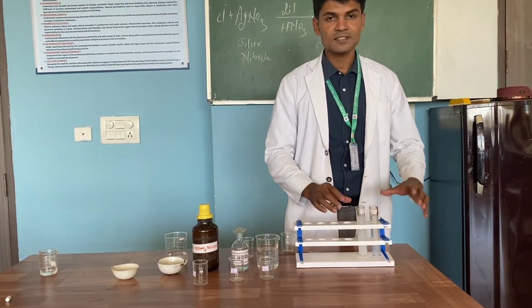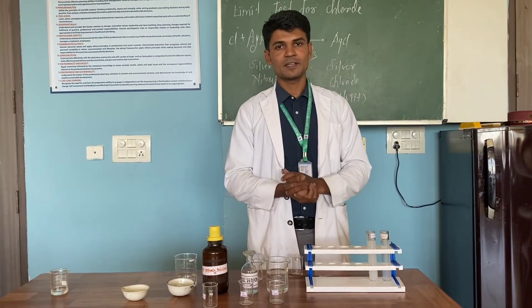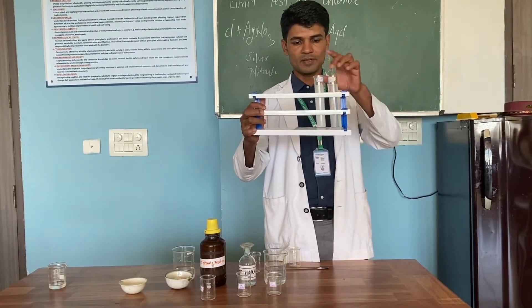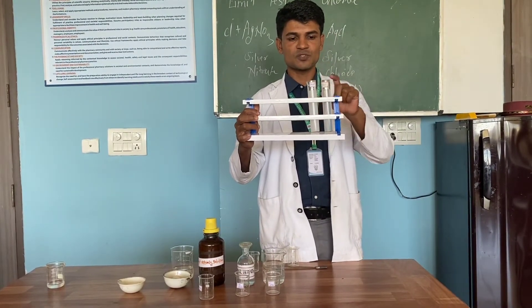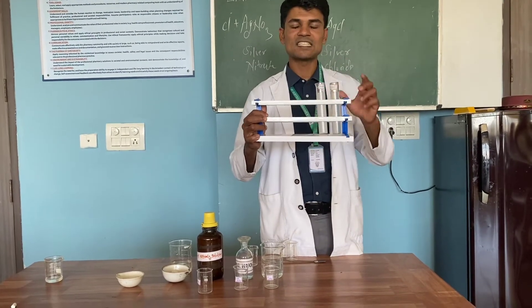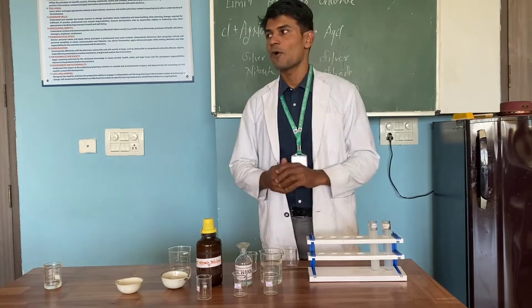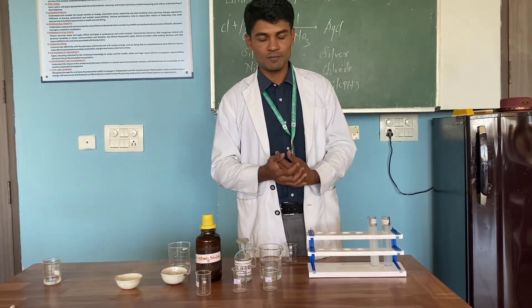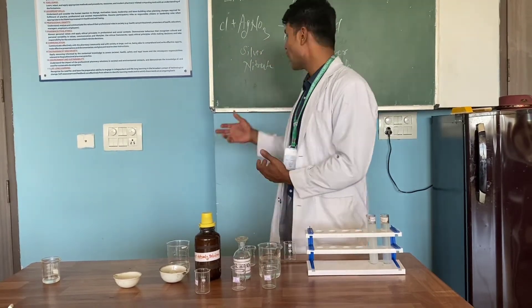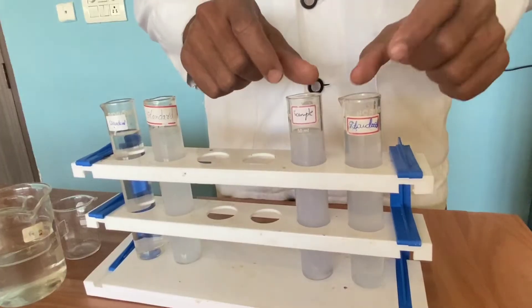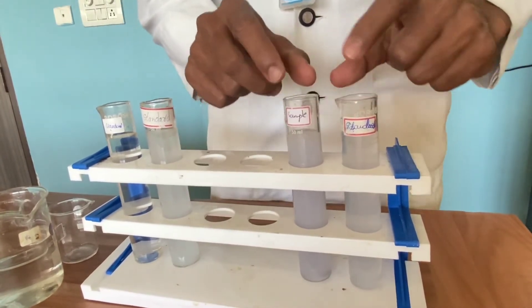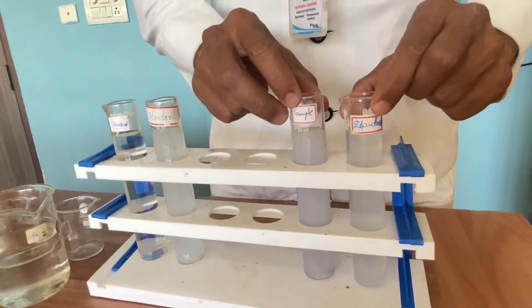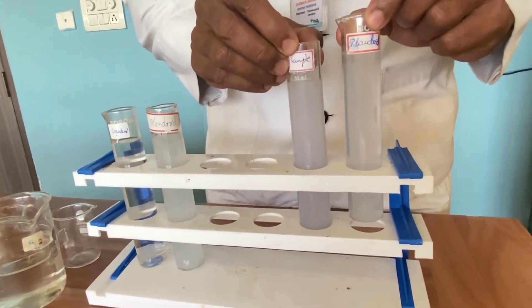Now after this, we have to wait for 2 minutes to see if turbidity has developed or not. But here we can already see turbidity developed in the sample. When the turbidity or opalescence formed in the sample is more than the standard, it means the formation of AgCl is more. The more Chloride ions present, the more AgCl will form, and the more the precipitate will be. Looking at these Nessler cylinders — this is the sample and this is the standard — there is less turbidity in the standard solution as compared to the sample.